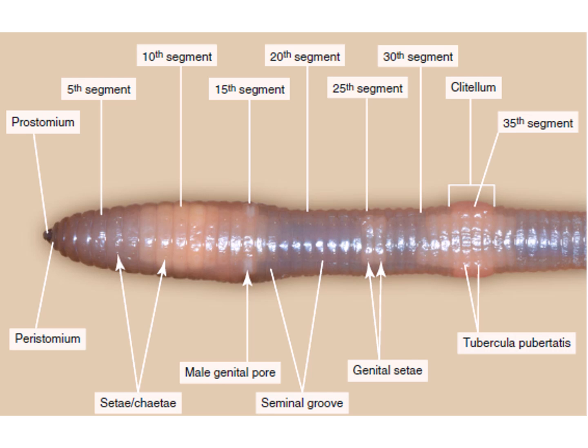They help keep the two worms anchored and aligned while copulating. Here we can see these genital setae. There are two pairs on this earthworm at the 25th segment in Lumbricus terrestris, upward toward the anterior side from the clitellum. These setae are not locomotory. They only appear during the breeding season in sexually mature earthworms.